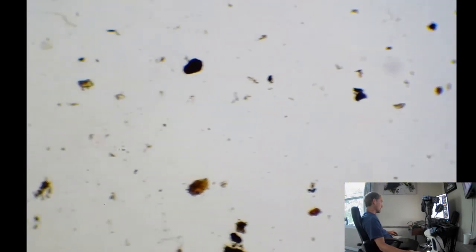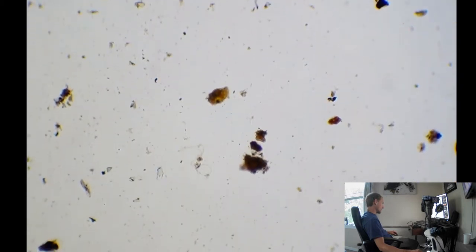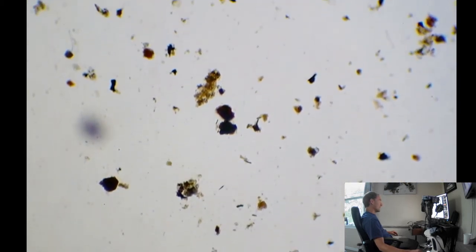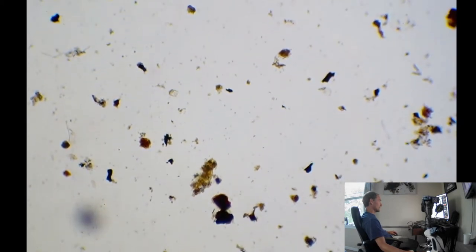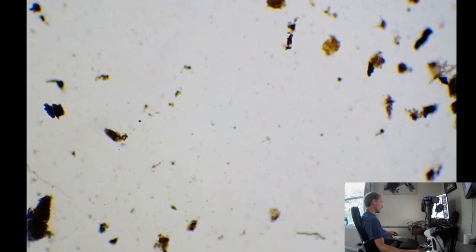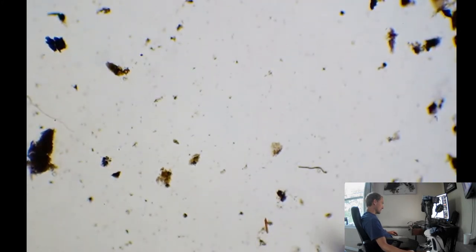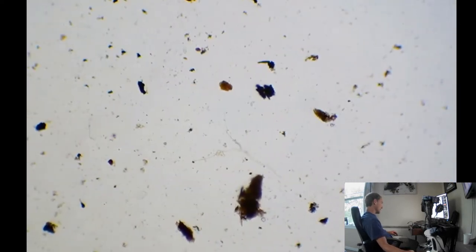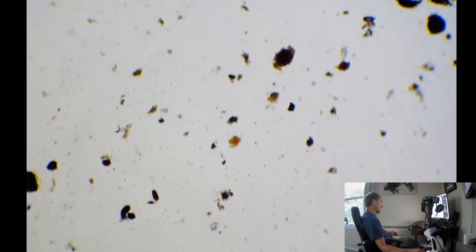And continue our scan. Ooh, over there I see a little clear strand, but let's look around a little bit to see if we can find any beneficial organisms first. Looking for anything moving or knocking these aggregates about. Looks like plant matter in the middle there. Might be a small fungal hyphae, that little strand. Pretty dark in color. Off to the side here it looks like a nice hyphae. Young one, clear. But before we inspect stuff like that, yeah, there's some organic matter.